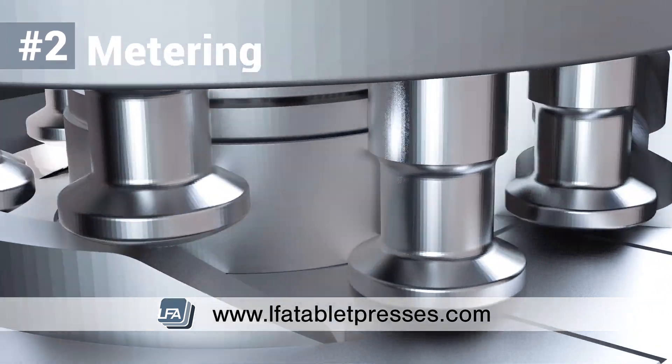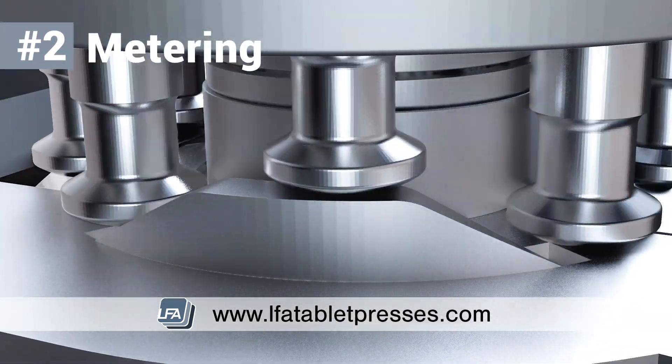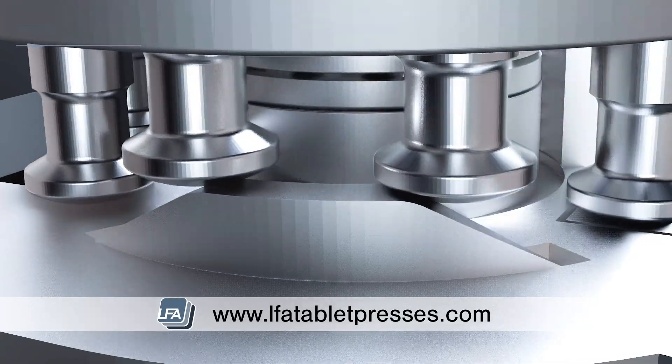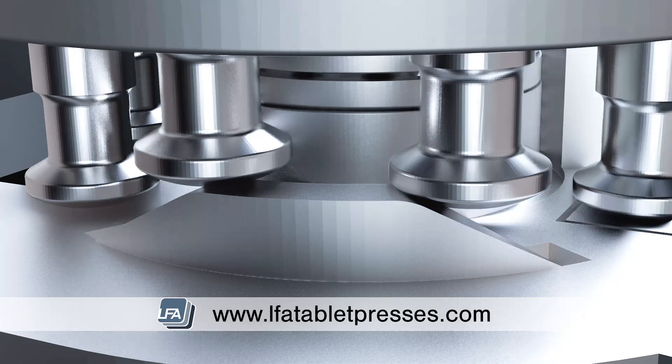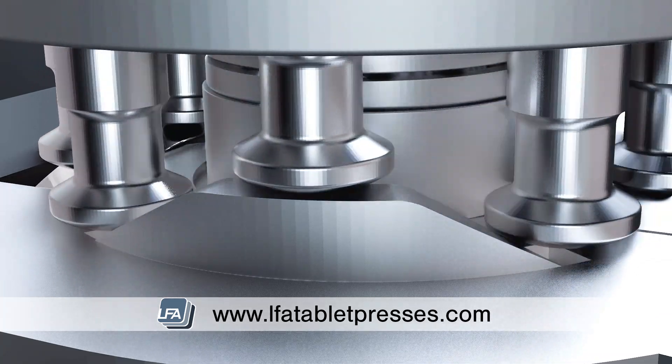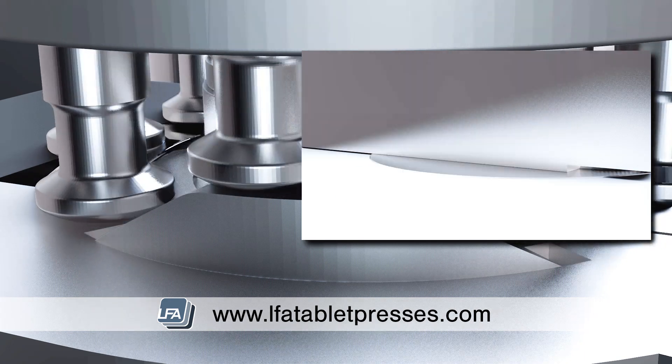Metering. Next, the lower punches will move over the metering cam, sometimes known as a dosage cam or weight adjustment cam. This will move the lower punches upwards to remove excess powder out of the die bore. The amount of excess powder will depend on the weight you've set your tablet press. The excess powder is scraped off the top of the die flat and will stay in the fill tray.